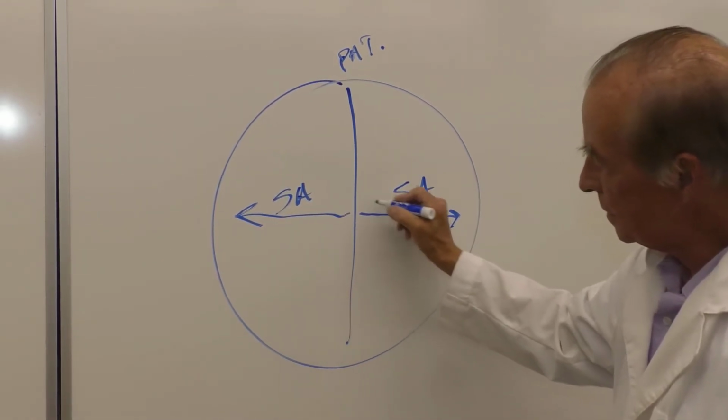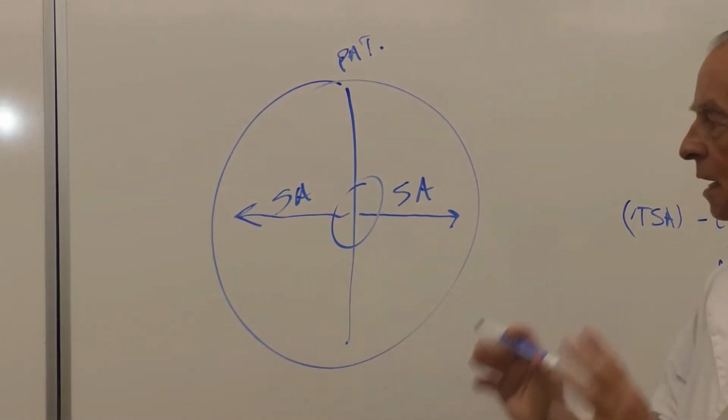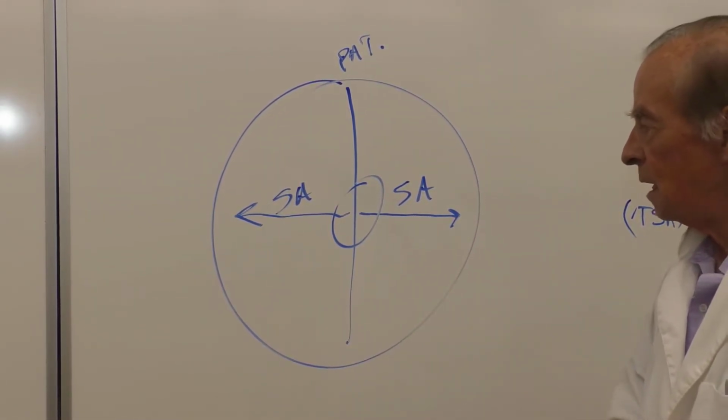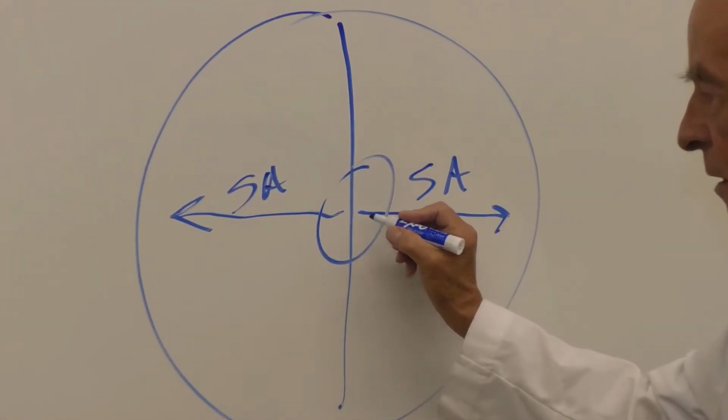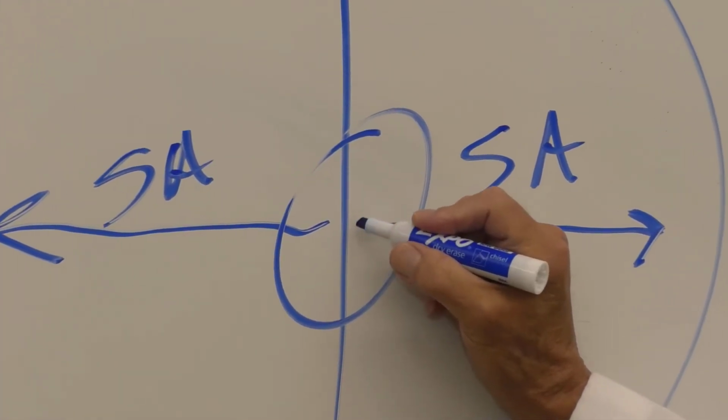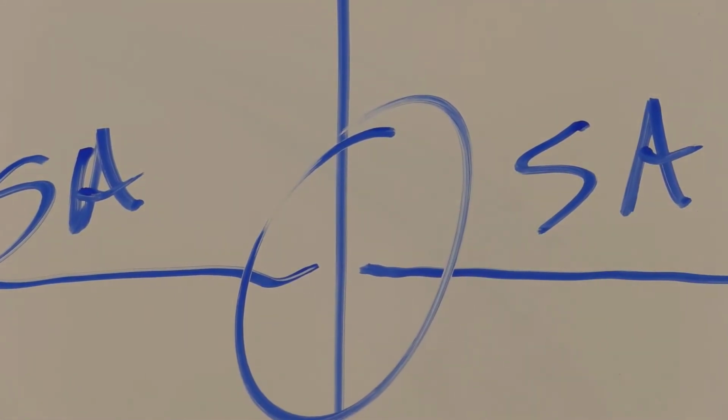And so it's this intersection where we'll see the enhancement of beta hemolysis after we incubate the plates. So that intersection, they haven't touched. So that's the tricky part. You want to be close, but you don't want to touch the original streak.